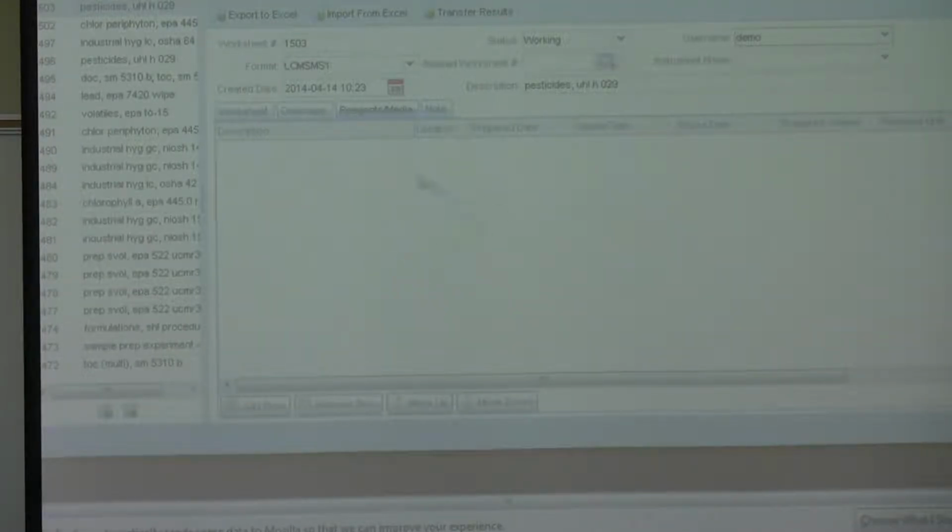Well, you will need to create a QC. Yes, they do come from the QC table, just like always. That's kind of where we've got everything loaded in there. So you'll have to create the QCs, and then you can just add them on to this tab like normal. And I'll go through that in a little more detail later here.